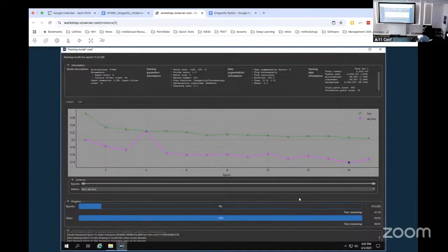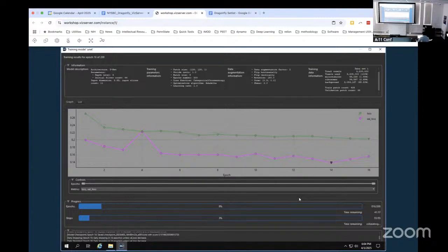this one? Then I open up. Well. Do you want me to find an output? We don't need any of these. It always scripts and puts it on the company next to it. So the company has to take. If this doesn't work with it, then I don't.